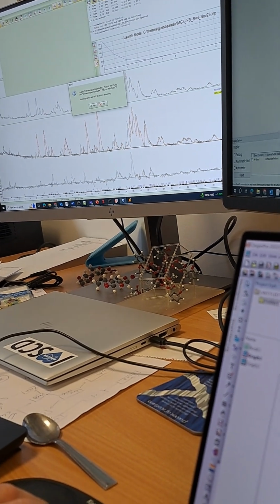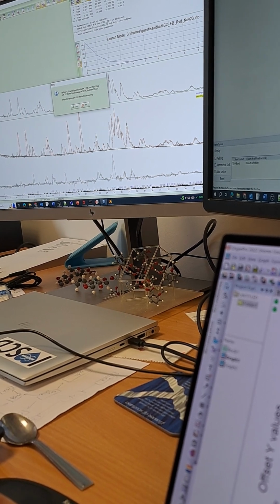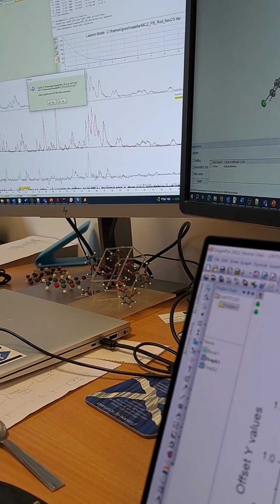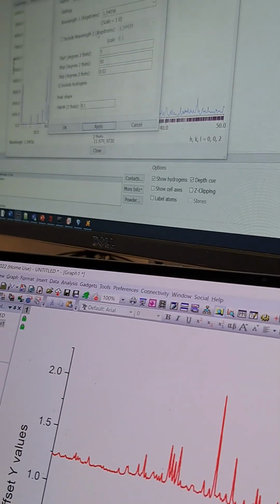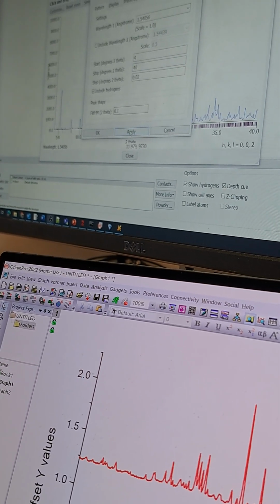Okay, our C axis seems to be okay actually. Where are the other misfitting peaks? It's these two here. There's a myriad of peaks here, about 3 or 4 different peaks in amongst this. This is where we want to have a look at your diffraction data here. I'm going to customize this so it becomes 4 to 40, and apply that.